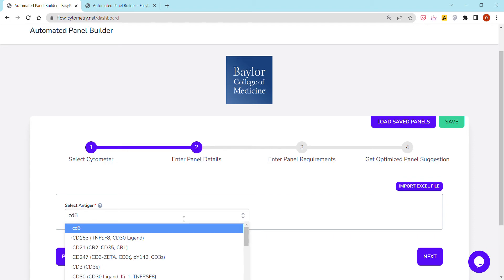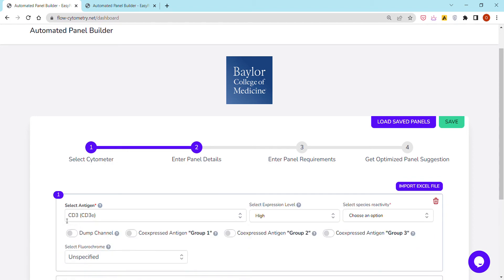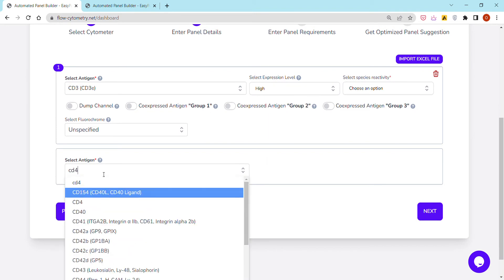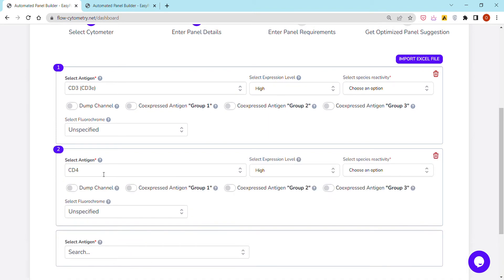Here I should enter the panel details, namely the antigens I'm interested in for my panel. We can either enter them one by one, just like I'm doing here and as I showed in the previous video.